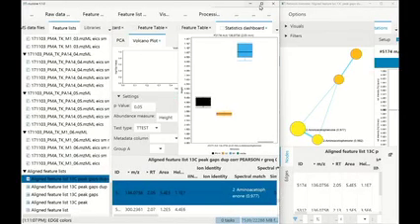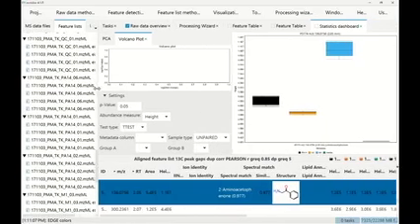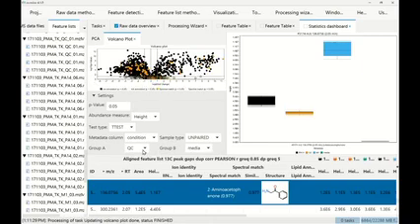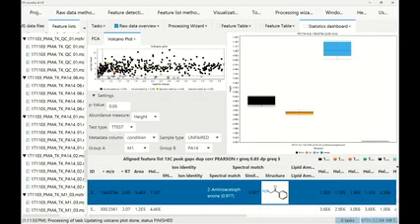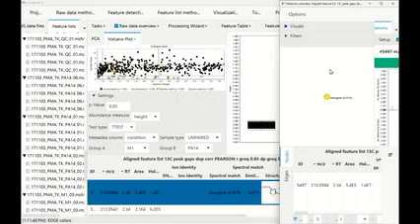But I could, for example, let me see, I could take the volcano plot here. So on the top there's volcano plot. I can go for condition, and then the 2 different strains. And then in the volcano plot we also see everything that is colored has an annotation, and I would then also focus on this node in the network.